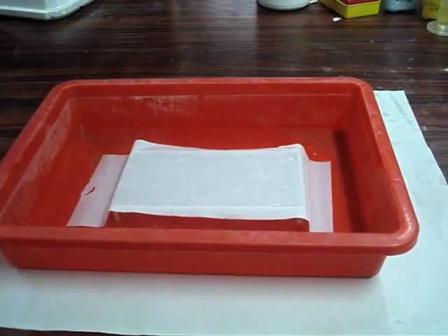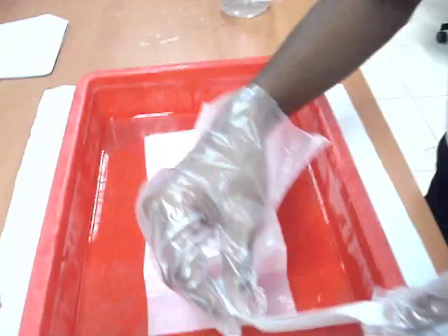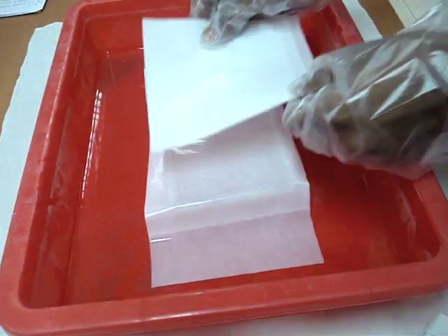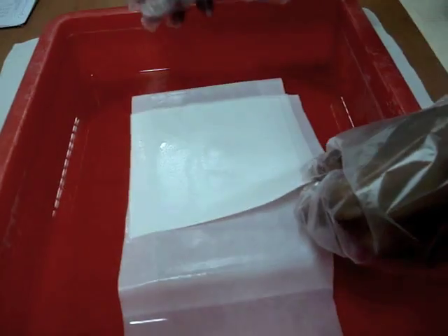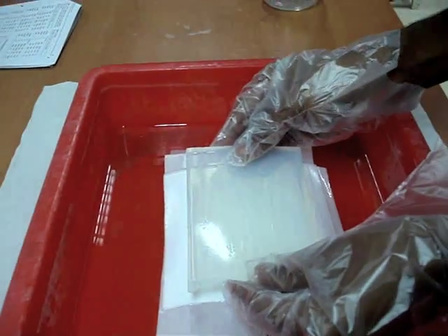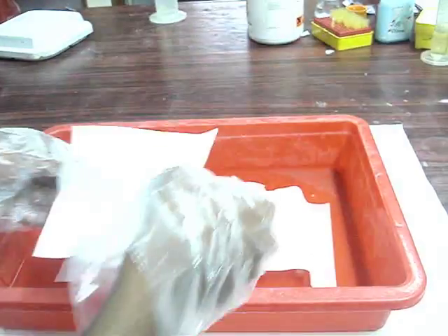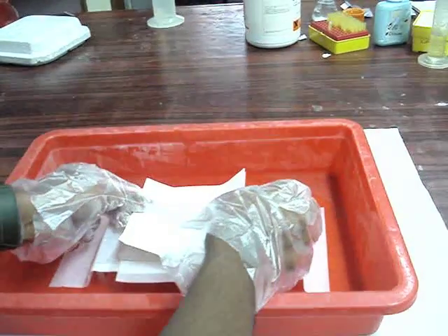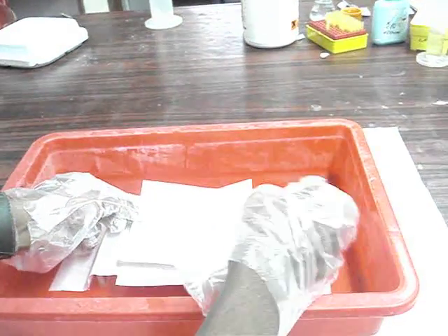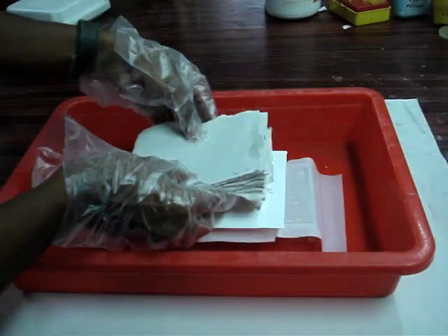Place the gel, then stack filter papers. Now place the gel over the filter paper. Place the nylon membrane over the gel. Proper care should be taken while handling the membrane. Place filter papers over the gel, cut to its size.